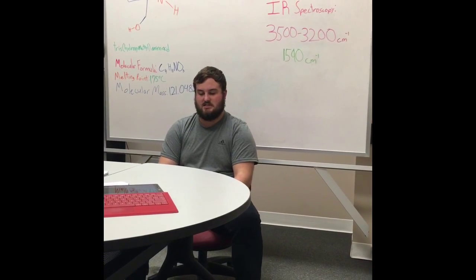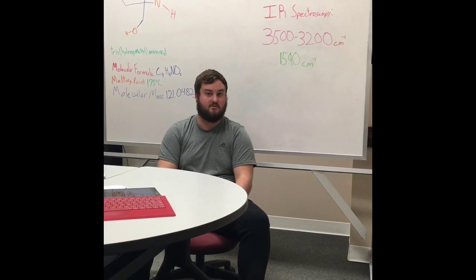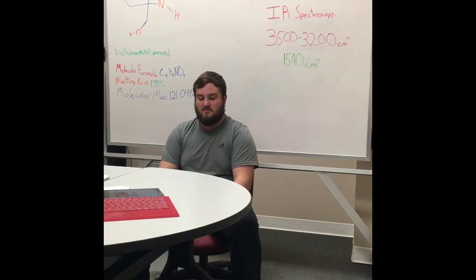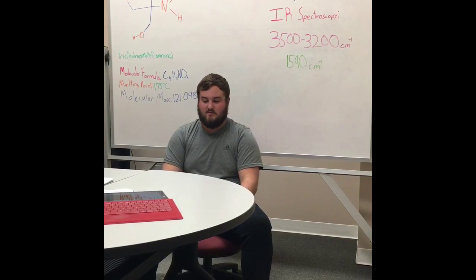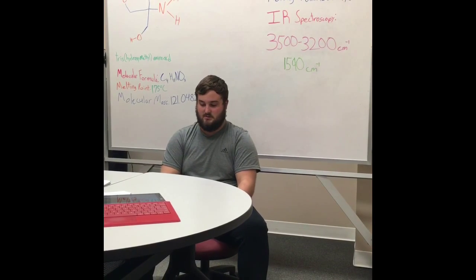Experiment 10 is designed to teach students how to identify an unknown using several different methods, mainly infrared spectroscopy. Infrared is the spectrum between microwaves and visible light on the electromagnetic spectrum. This range is between 4,000 and 400 inverse centimeters.